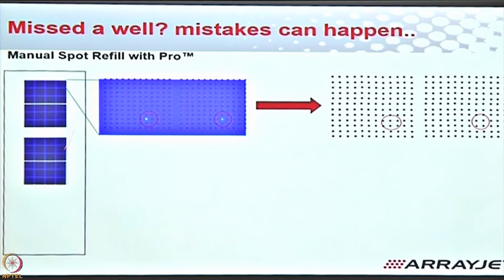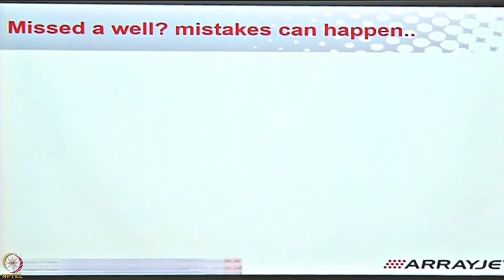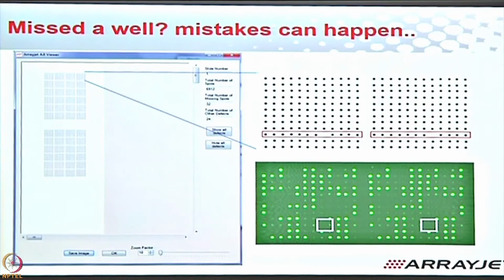And then when I start this overview run, the green area is where it will show me, to double check and verify, that yes, the antibody that I just went and refilled is definitely going to get printed. It's not that I'm missing my entire experiment and the whole thing has gone to waste. It'll remember it and show you just to double check. Are you happy with this? Can I start? Can I press yes? You said yes. And then, ta-da, that's it.